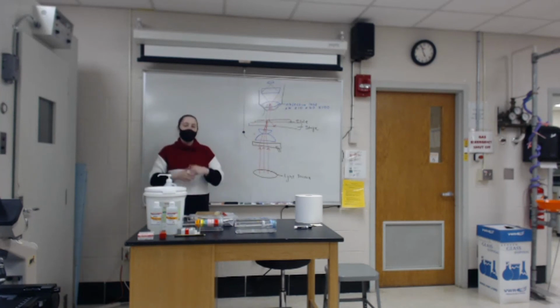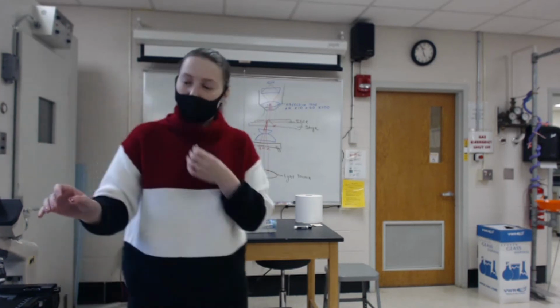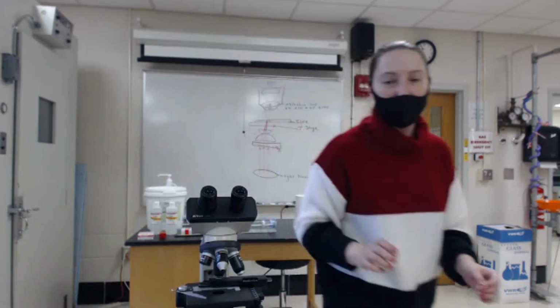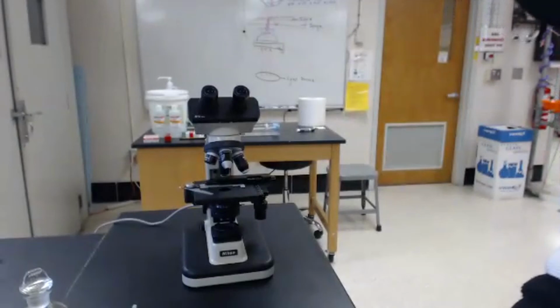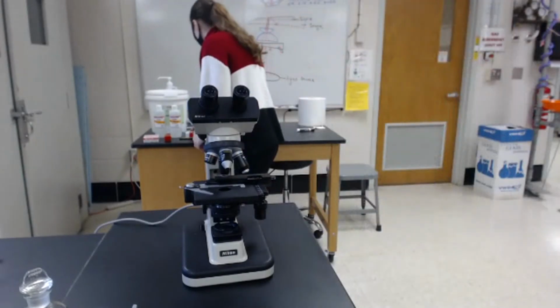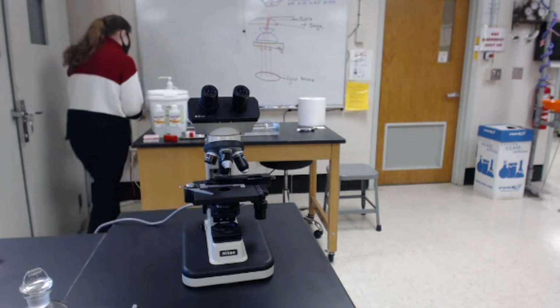Okay. So now what I'd like to do is show you the process of using the oil immersion lens on the microscope itself. So I'm going to try to adjust the camera so that we can see this quite clearly. Just getting a slide.